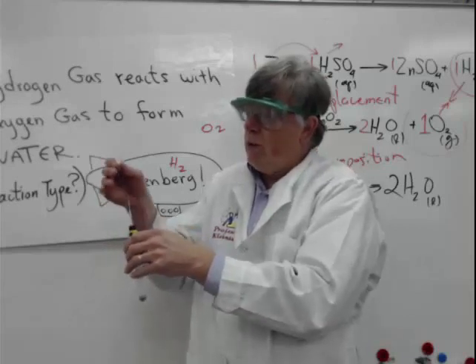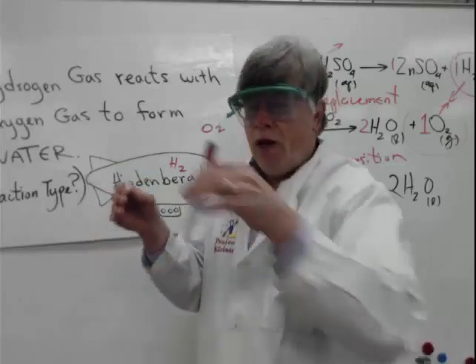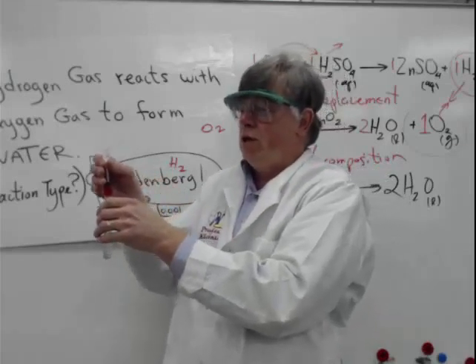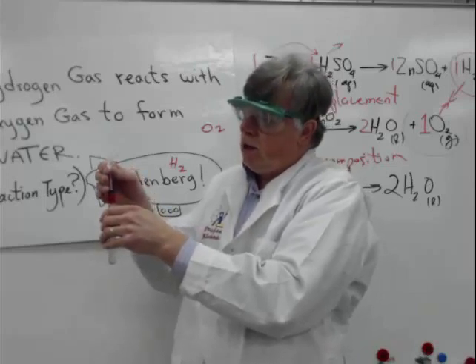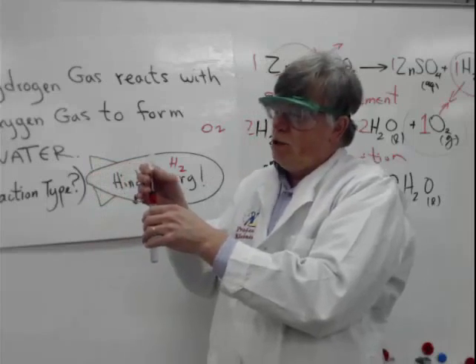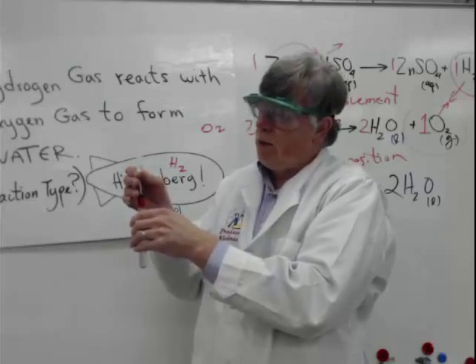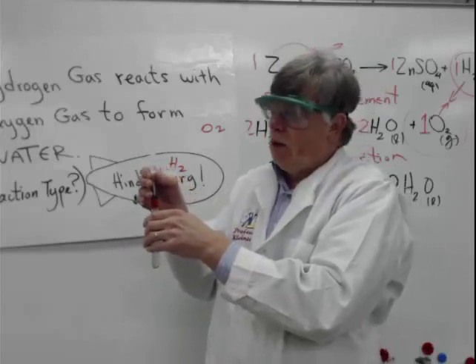Okay, very good. That's probably enough hydrogen. That I set down. Now here is my oxygen gas generator with the hydrogen peroxide in it. I put it in and notice now I'm producing the oxygen gas, and it's slowly flowing in here. I'm going to add enough oxygen gas so it's about a 2-to-1 ratio, twice hydrogen to 1 of oxygen. And I will leave a little water in here because I don't want to see the gases escape.